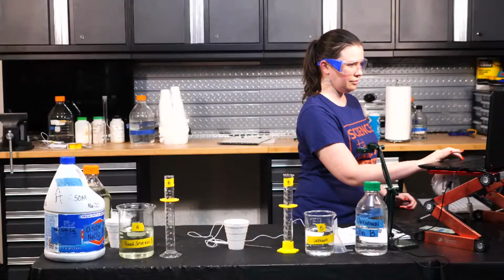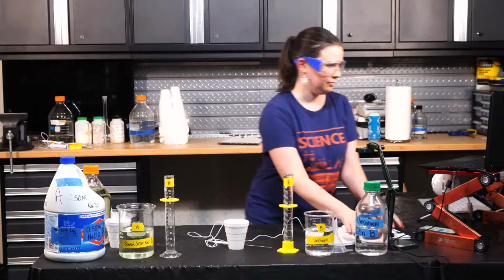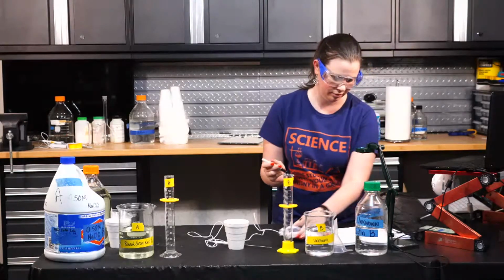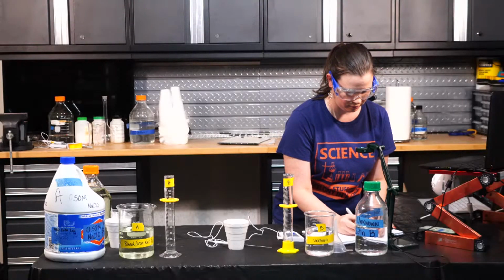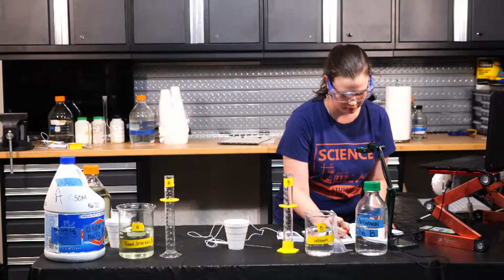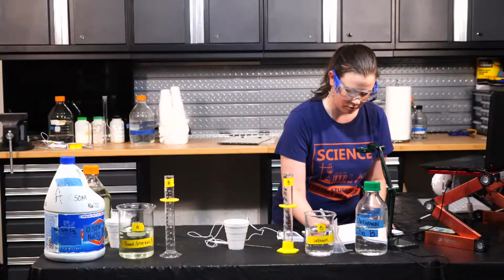Okay, so we came to a consensus. We decided on doing 5, 15, 25, 35, and 45 milliliters of bleach for our levels of independent variable.